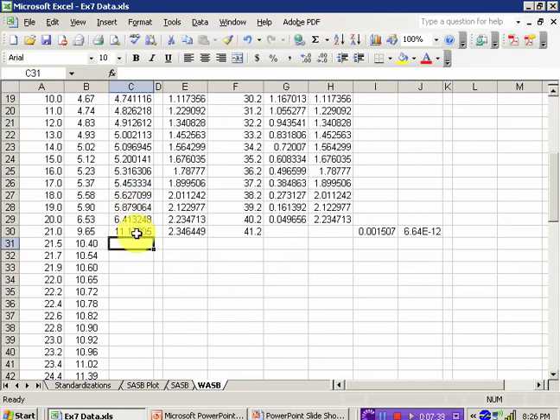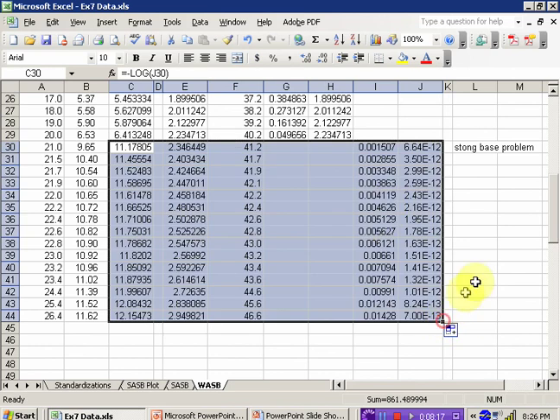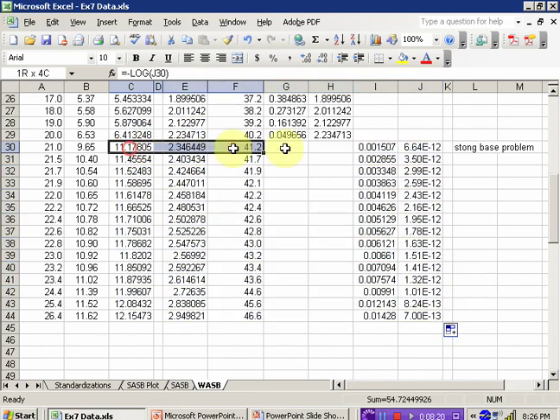Now in this case, the student collecting this data skipped right over the endpoint of this titration, and there's a big jump in the measured values. If the student had managed to get a data point very close to the equivalence point of the titration, you would do a weak base problem, but this is a strong base problem at this stage. Getting a data point right at that sharp transition can be quite difficult, and so it's understandable that they've missed it. Hopefully you got it, and you'll do a simple weak base calculation for a single data point there at your equivalence point. But now I'm to this stage where I'm in strong base, and it's going to be the same till the end of the titration.